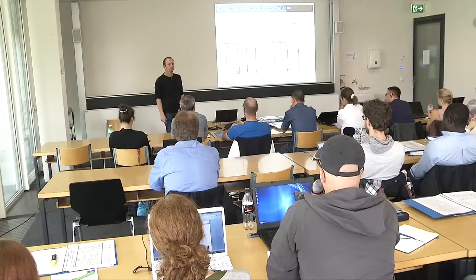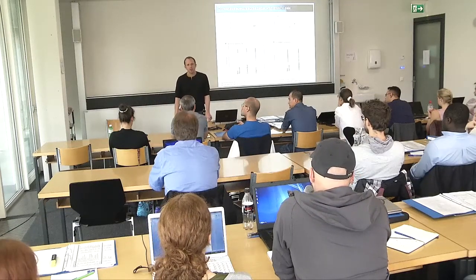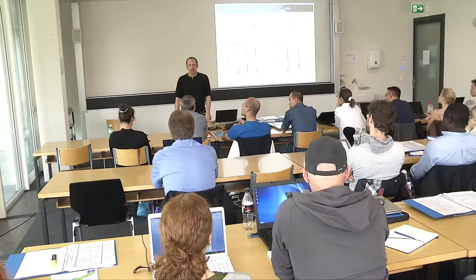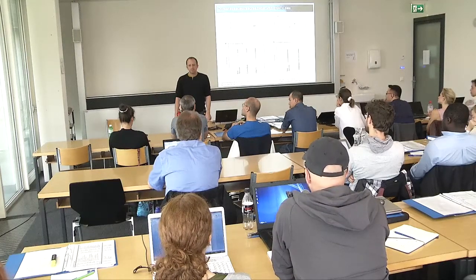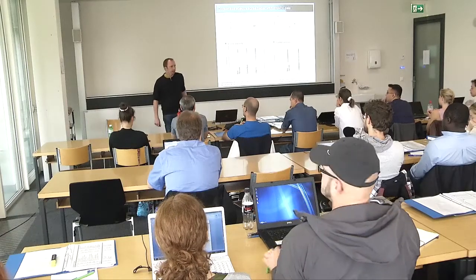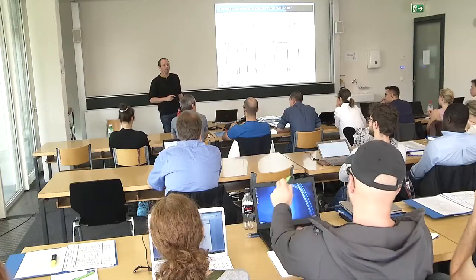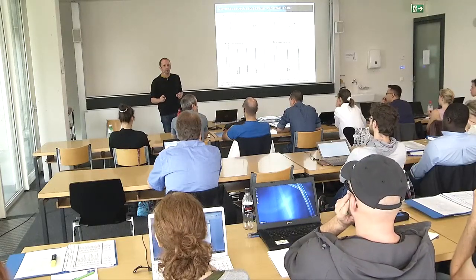Okay, and second question. Which retention time is picked? Do we average retention times as well for the spectral libraries? Is this just a pick of the best spectrum? Is it the same for the score? Yeah, so yes, we do. But we do it after the transformation to IRT space, right? This is important. In order to do this, they need to be on the same scale. And I think we're taking the median, and I think there's even an outlier removal. And this is fairly stable.